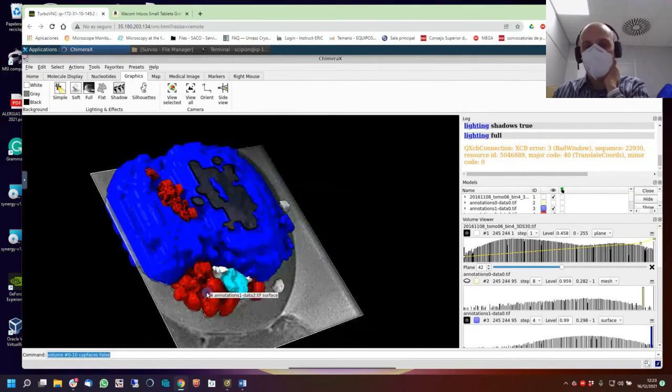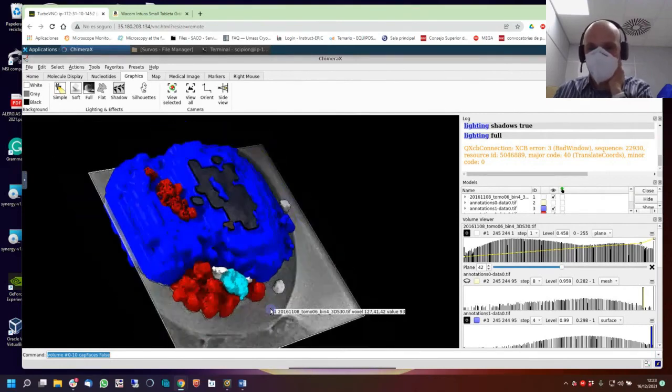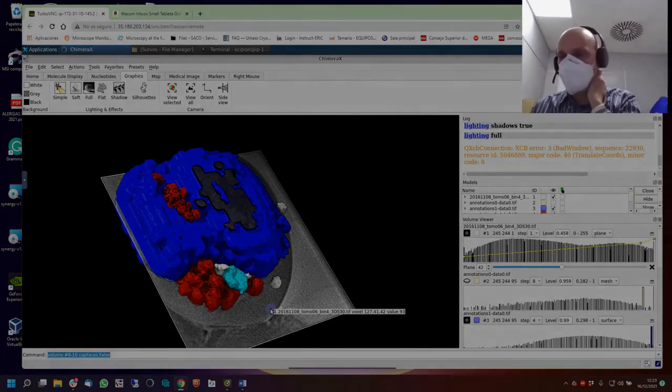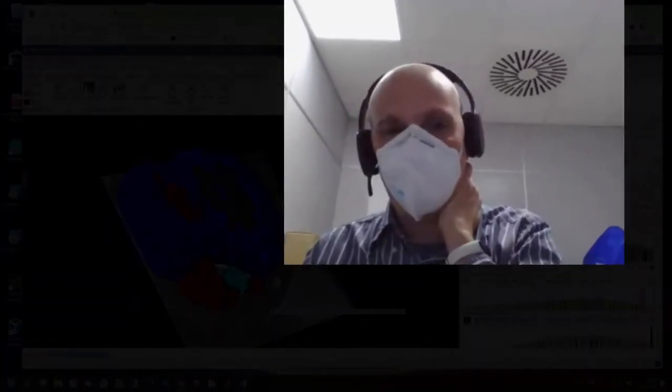But there's a reason why you need time for the segmentation. It takes too much time. It's too manual to make segmentation accurate and everything. It's more or less like this. You know more or less how to play with this, how to visualize or unvisualize stuff.